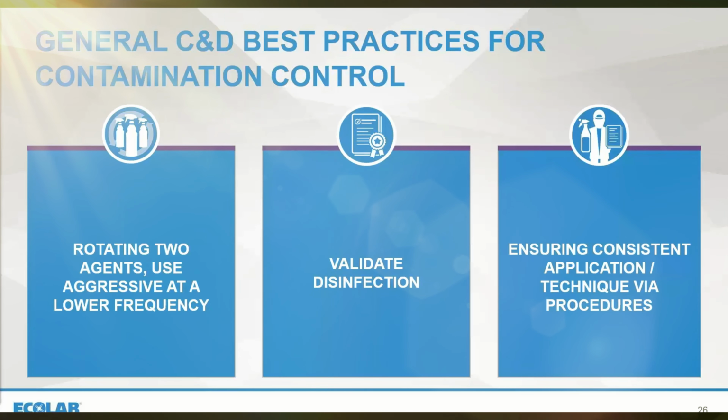Validating disinfection is a requirement, but it's also really important for yourselves that you get the evidence that you are getting the contamination control, that the disinfection is effective in your facilities. So it's important that you step through that validation process to get the assurance up front that you've selected the right products, that you're using them at the right frequency, and that your rotational strategy is effective as well.